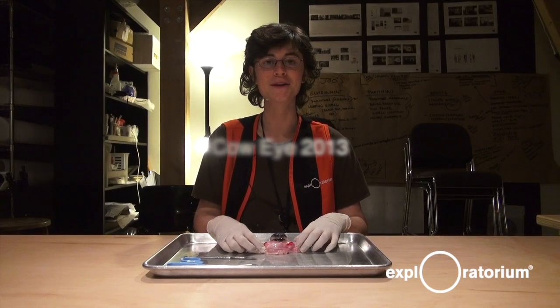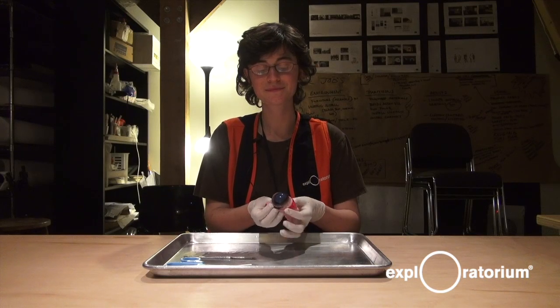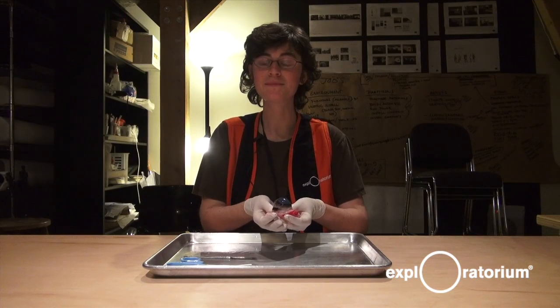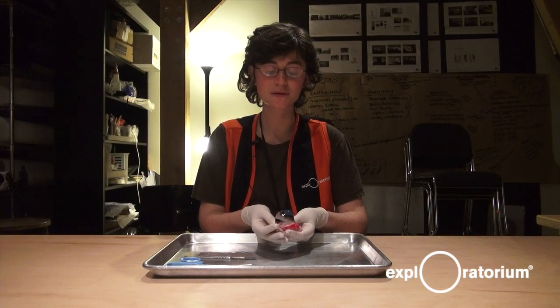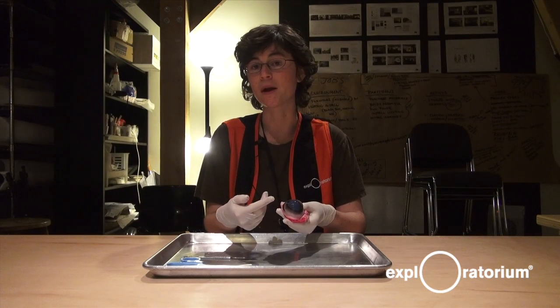Hi, my name is Rose, and I am an explainer here at the Exploratorium. I'm going to do a cow eyeball dissection. Here we have a cow eyeball, and they are very similar to human eyeballs, which is the reason we dissect them. By learning about a cow eyeball, we can learn about how our eyeballs work.